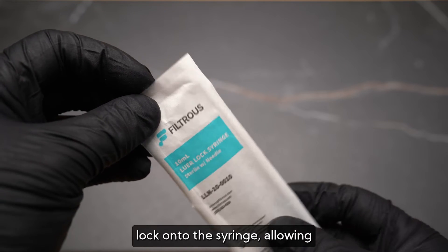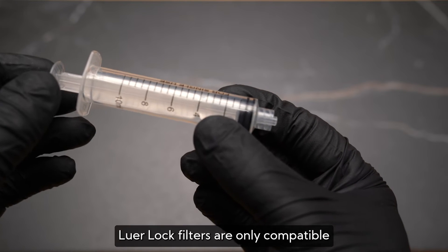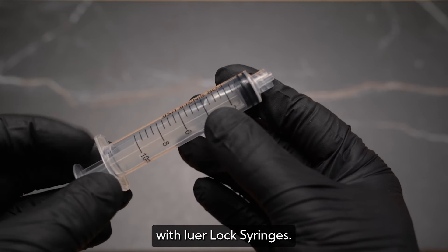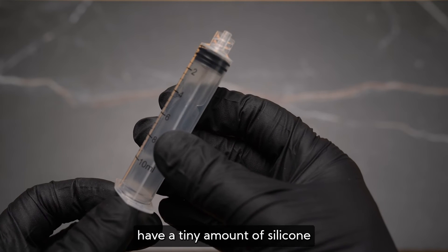Luer lock fittings lock onto the syringe, allowing greater pressures to be pushed through the syringe without the filter popping off. Luer lock filters are only compatible with luer lock syringes. Choose luer lock filters for a more secured fit and for any application with high pressure.